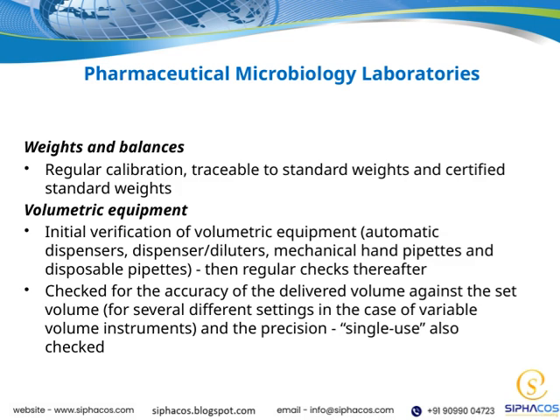All these steps are vital in our pharmaceutical microbiology laboratories because they underpin the reliability of our results and help us adhere to strict quality standards. Consistent calibration and verification are the backbone of maintaining the integrity of our testing processes.